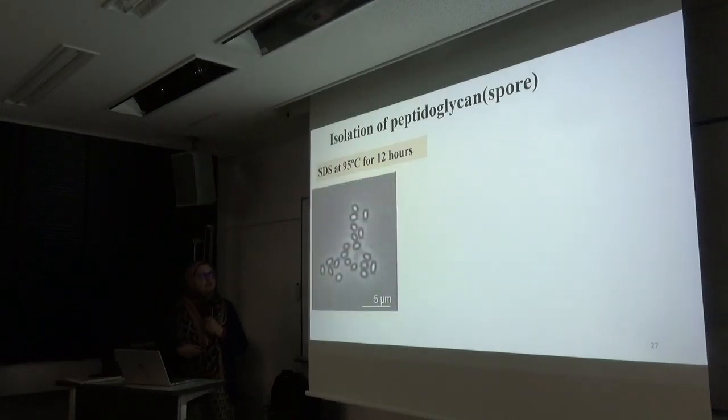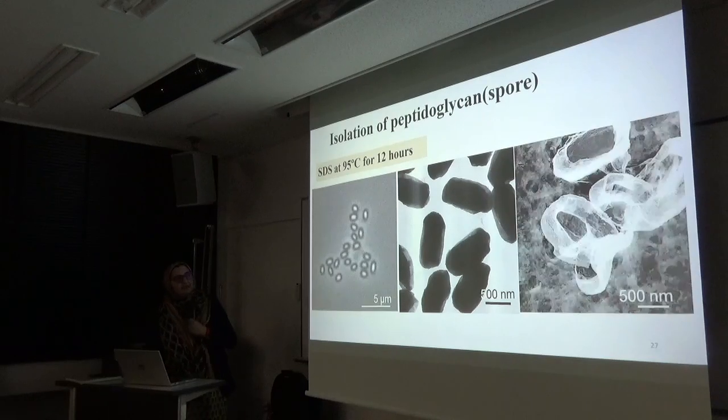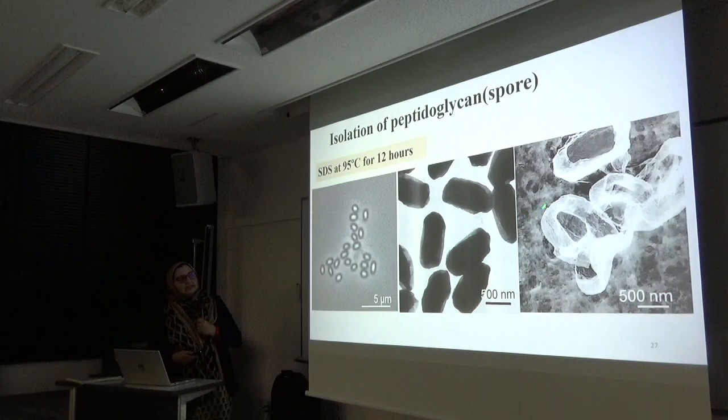This is the result by optical microscopy, and we can see that there is some difference in the spore. But the clear difference we can see is that the structure of the spore is clearly compact, and there is no additional layer here. We can also see the same effect on the spores under quick freeze deep etch electron microscopy.